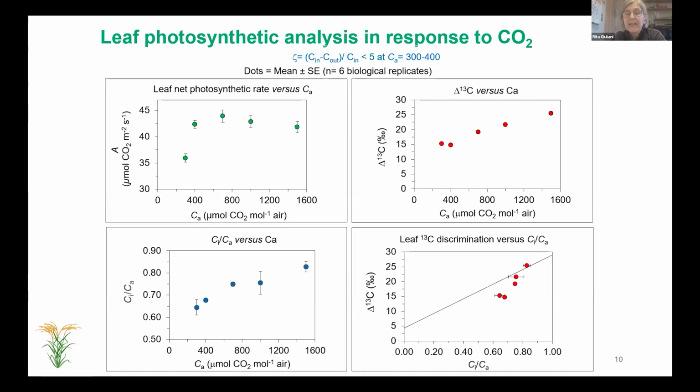We plotted the 13C discrimination versus the Ci over Ca and see an increasing trend of the values that reach almost the theoretical increasing line.